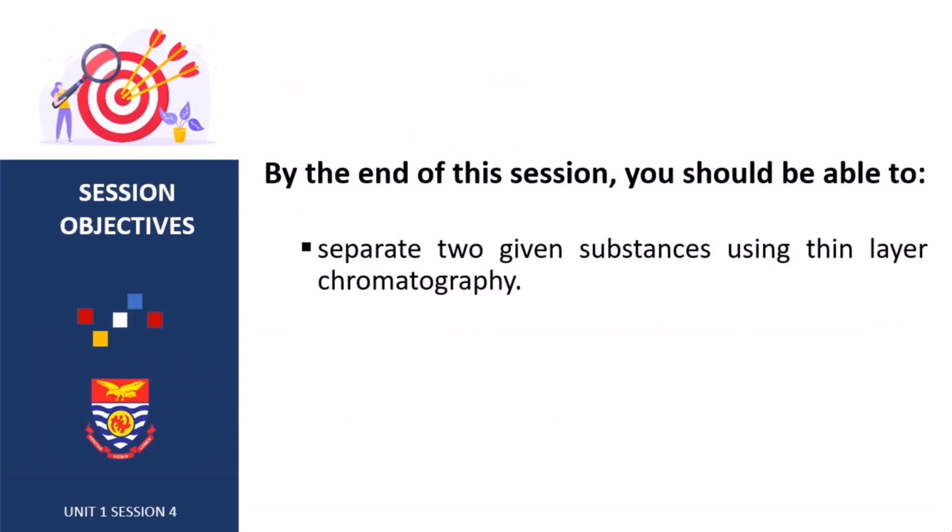So at the end of the session, you should be able to separate two given substances using thin layer chromatography.